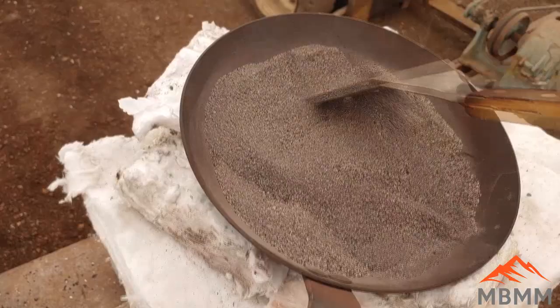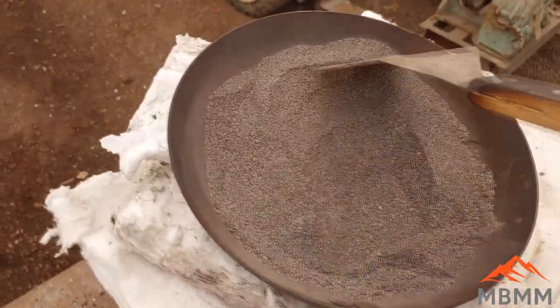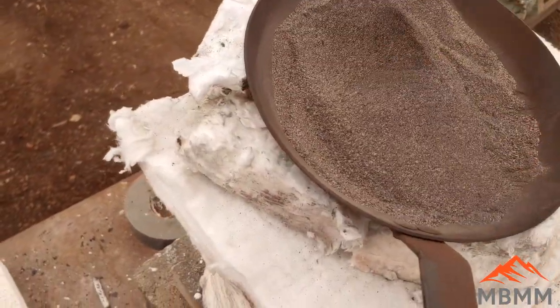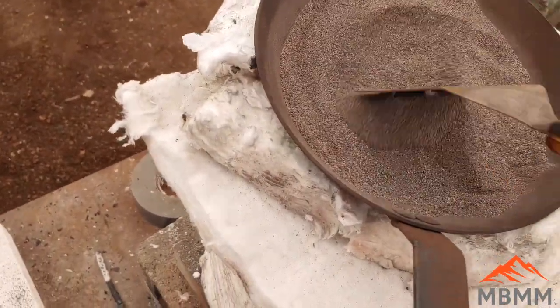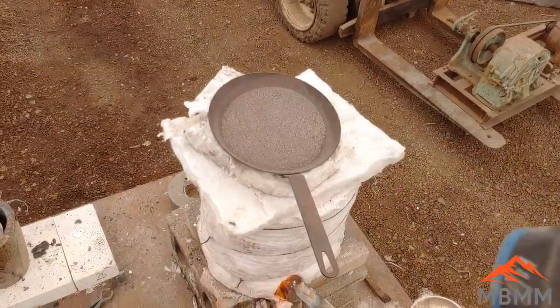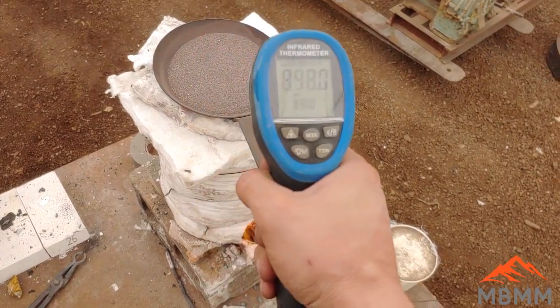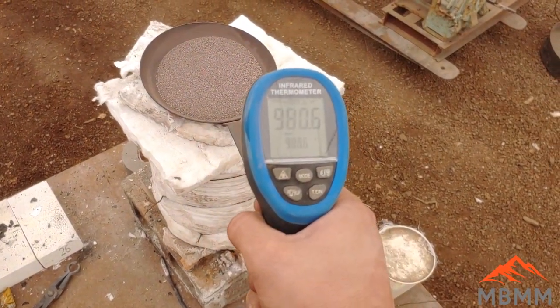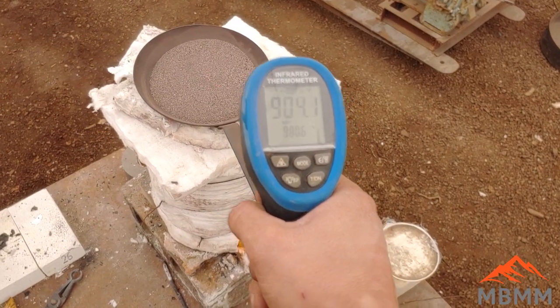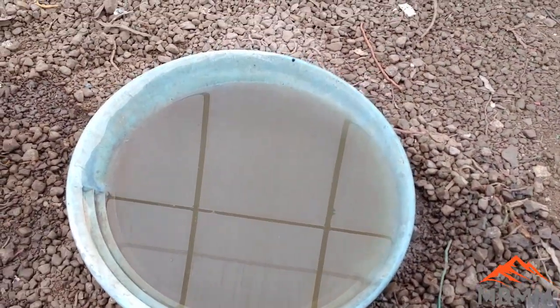Right now we're taking our second sample — the one that we did not pan — and we're roasting it over our furnace, trying to convert all the sulfides into oxides so that they'll be dissolved in our slag. The sulfides need to reach a temperature of a little over a thousand degrees Fahrenheit; I shoot for between a thousand and twelve hundred degrees.